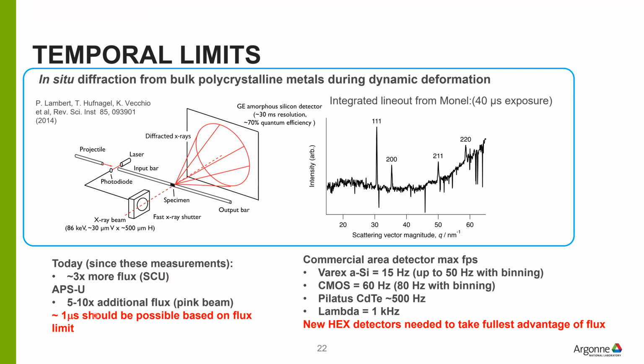Now, of course, one of the limiting things is the detectors, and we're looking at various detector technologies. Some of them are now starting to reach this type of resolution. It's not mentioned here, but these are some of the candidates we're considering to get as close as we can to this 1 microsecond type of temporal resolution.